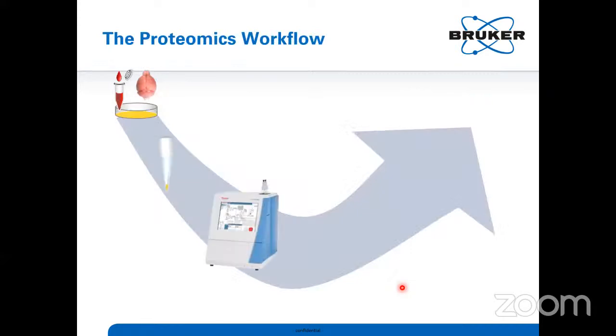This is a proteomics workflow where you will extract different proteins at a time. Whatever we discussed in our previous slides is single protein characterization. When you want to analyze a proteome, a complete bunch of proteins at a time, you will digest the complete proteins in a single Eppendorf tube as a sample. You will generate the peptides. In that case, your instrument should have high scan speed. At a time, you will release a number of peptides or more. Still, your instrument should be able to identify every peptide.